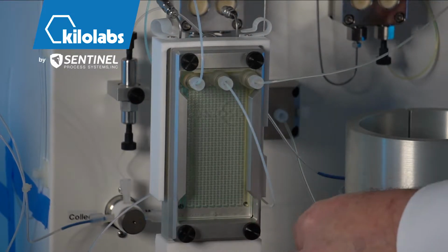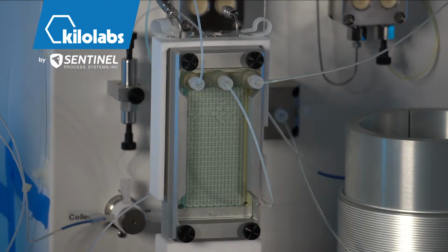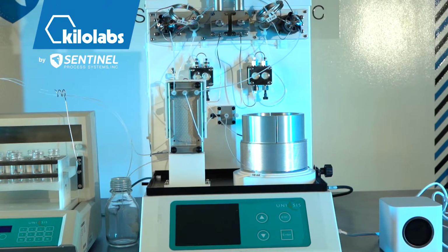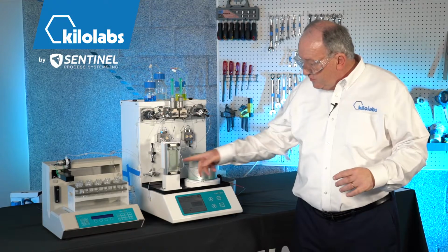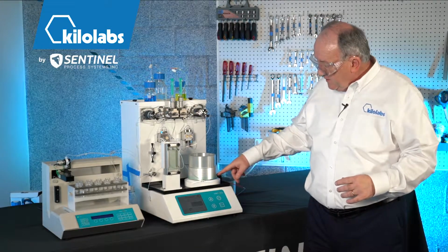From the outlet of the chip, it's going to feed through this pressure transducer. We're measuring the system pressure here, into the coil. And you're going to slowly see the green come up along the coil. In essence, about 1 or 2 minutes has elapsed. We've got the green mixing fluid going through the chip. And as you can see, the green is now starting to show up in this transparent coil.